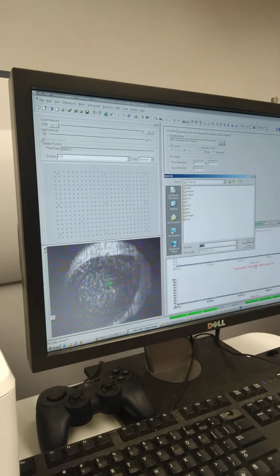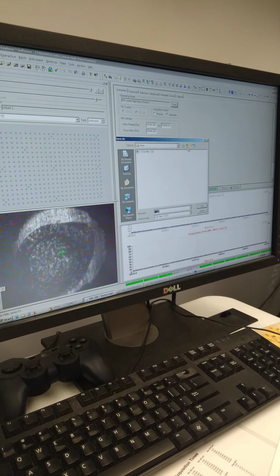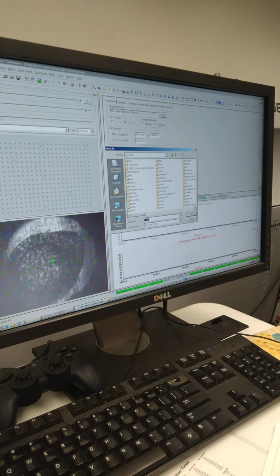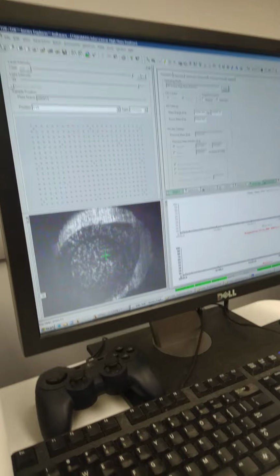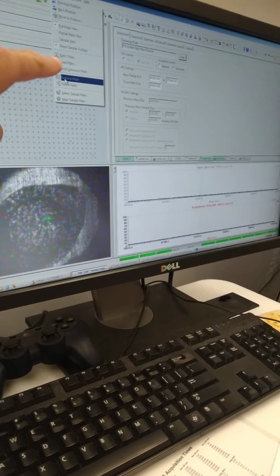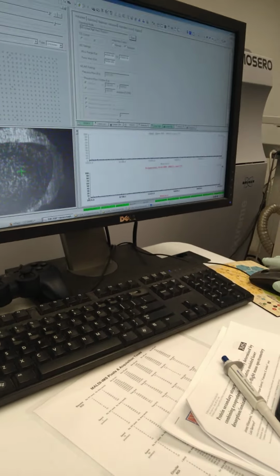And then you want to go up and navigate to your group. Yeah, that's the one you want to save. And then you want to click up and navigate to your group and save your data in your data folder. So when you're done, your data saved, to eject the plate, you would go to Plate, here at the top, Plate, Eject Plate, or you'll see the shortcut icon there on eject plate, so you could use that as shortcut, and it says, are you sure you want to eject the plate? And you're like, yes, okay.